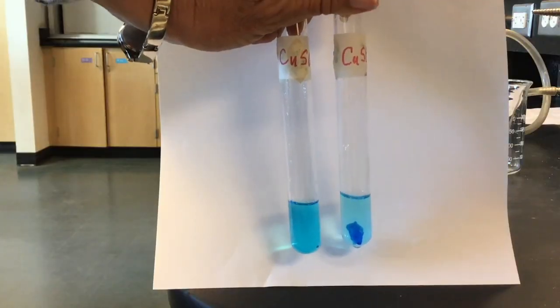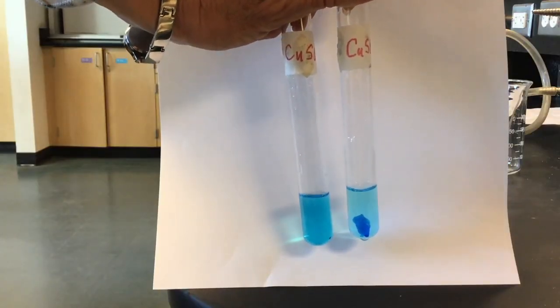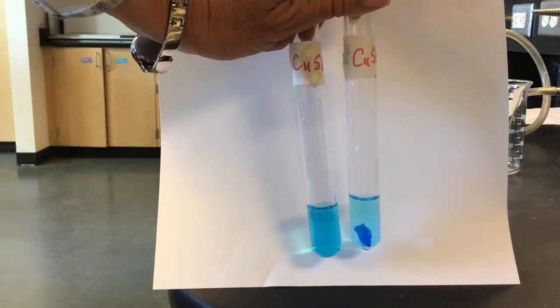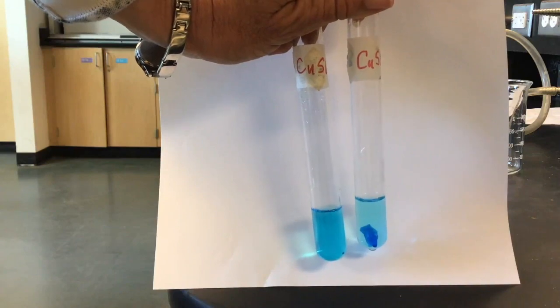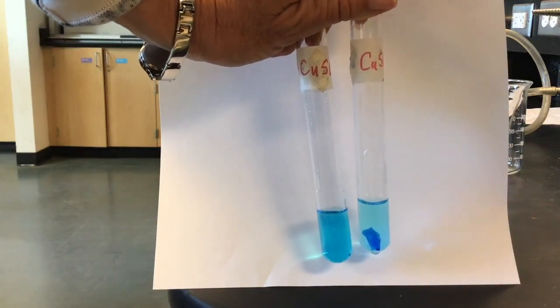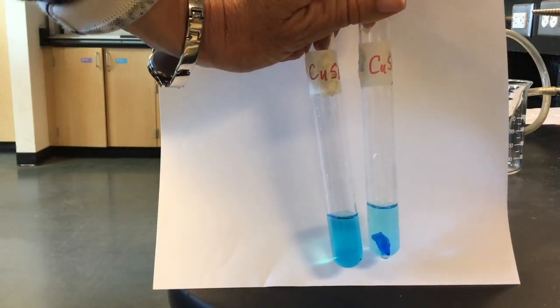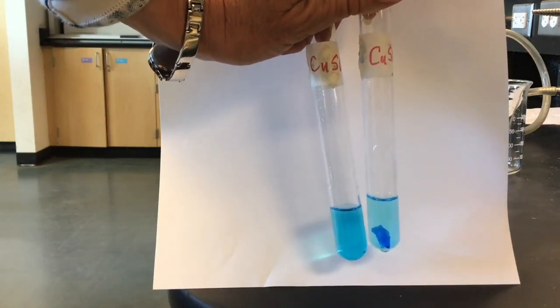Now we can compare our two solutions after 2 minutes. The one you can see still has the large crystal in it. The other one is just about dissolved. There's a little bit of small crystals left on the bottom. So you can also compare the color of the solutions, which one is the darker blue, to see which one dissolved faster as well.